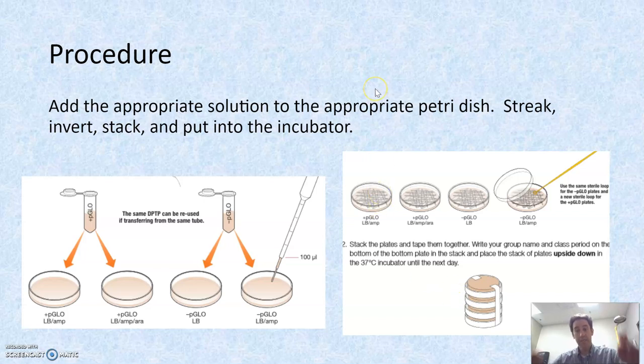And the hope is that some bacteria manage to take in that plasmid, and that's going to affect their phenotype. And then we'll see if the predictions you made in the pre-lab were supported or denied. So that's pretty much it.